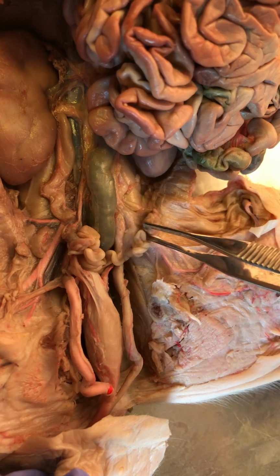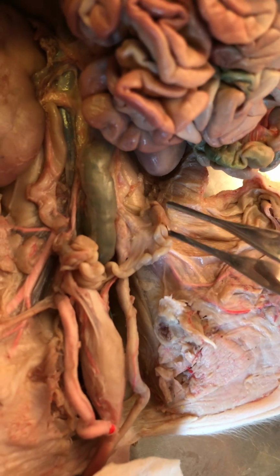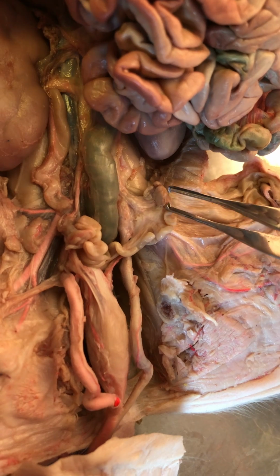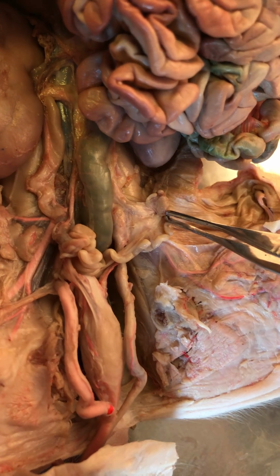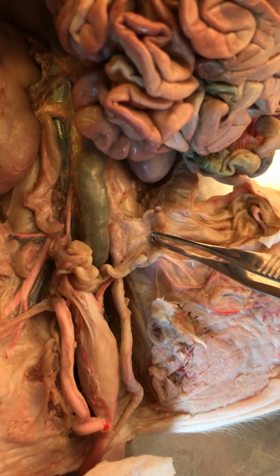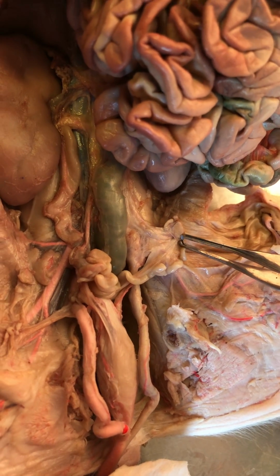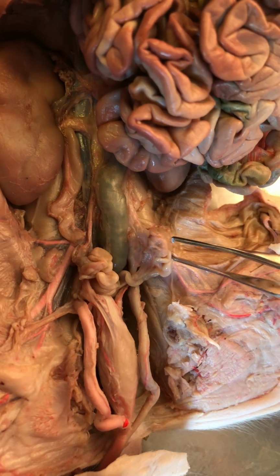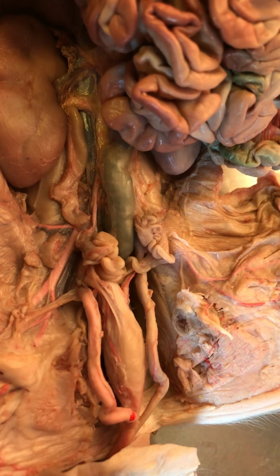Okay, perfect. So we have a beautiful little ovary here, and then notice we see this tubing, but we'll get to that in a second. It might not be what you think it is, because what we want to do is look on the posterior aspect of the ovary and see those little tiny tubes that are over here. Let me turn it over on the other side. Is it, or is it there? Oh, this is where it is. Okay, there we go. I wasn't making it up.